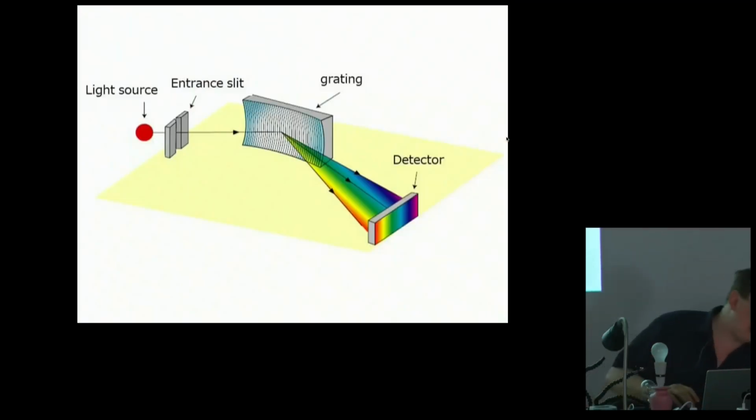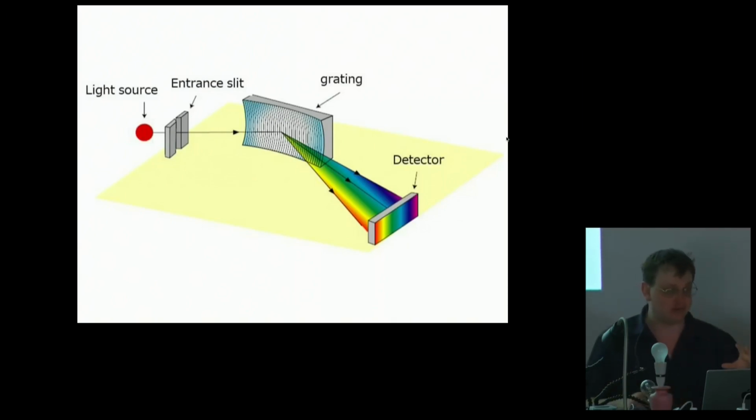It's actually quite a little bit of kit I've got here. It still costs quite a lot of money, so I'm glad I inherited it, not bought it myself. Professional, really good ones will be really chunky bits of kit, but they all work in the same way. You start off with a light source, which comes in by something like this, which is a fiber optic cable, and it goes through an entrance slit to get a narrow beam of light, and then goes to a grating.